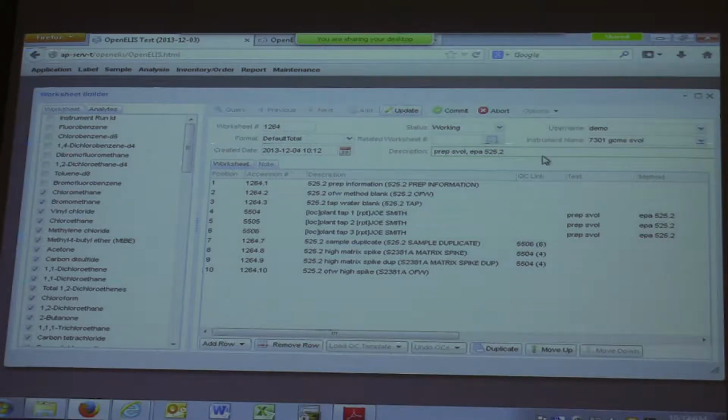Okay. And then if there were other runs on here, or if one of these was something I was using for, say, a DOC, a demonstration of capability, I can add that manually. I can say, I don't know, whatever, DOC. And that can be used for querying later on, if you choose. Or say if I had DOCs on there and, I don't know, MDLs, or a PT, it could be used for tracking those kind of things.